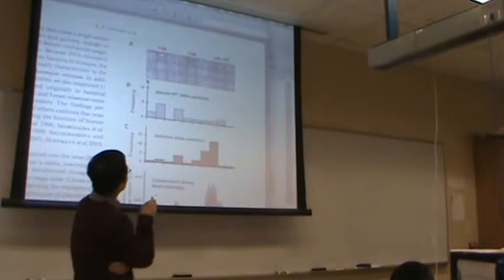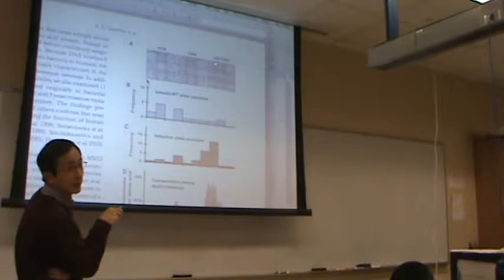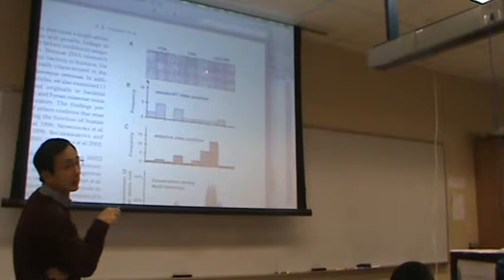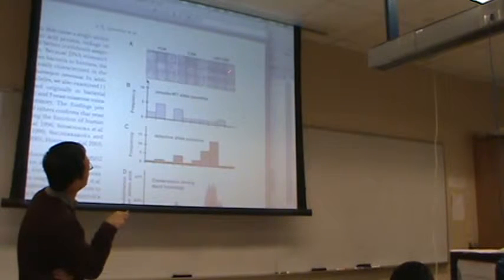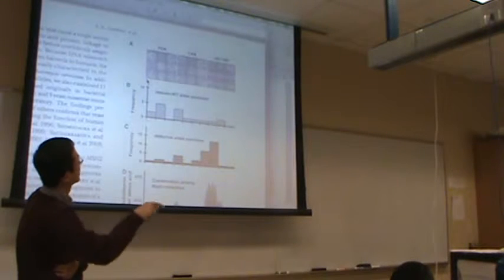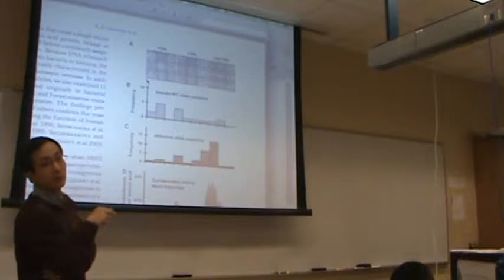So this is the wild type. Delta is the deletion of MSH2, the vector control. Those are various mutants. R542P, that's probably the last two, I don't remember. Those are just several mutants.